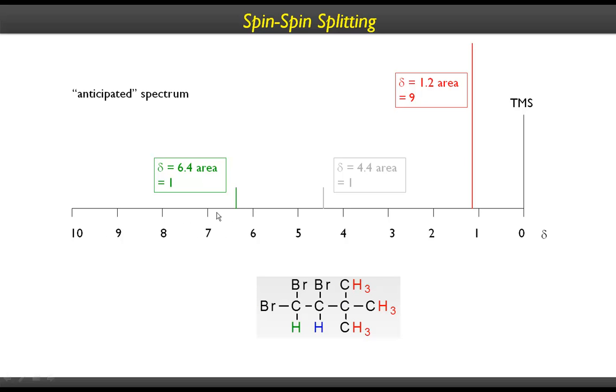You can call this side higher chemical shifts and this side lower chemical shifts, but remember, this is called high field and this is called downfield. This area is shielded, this area is said to be de-shielded. The hydrogens that resonate in this area are said to be de-shielded. These hydrogens are said to be shielded. They are attached to electropositive atoms compared to these ones. Anyhow, that's what we have been discussing so far in proton NMR.